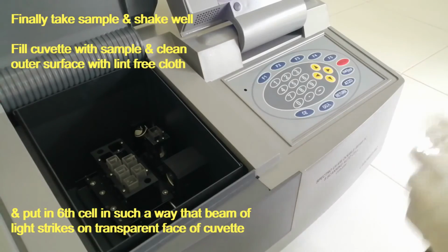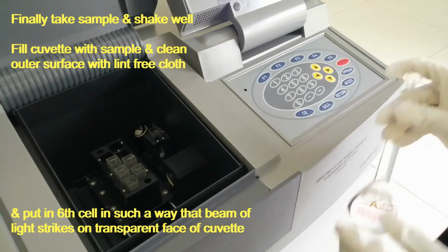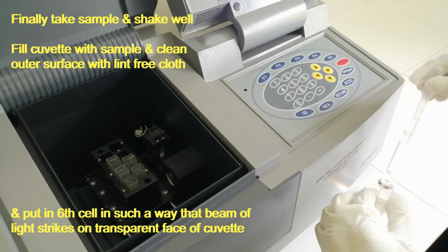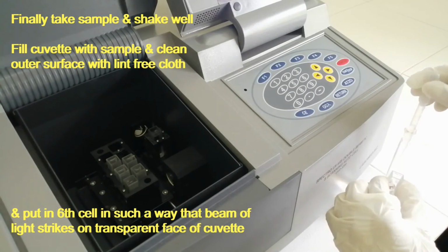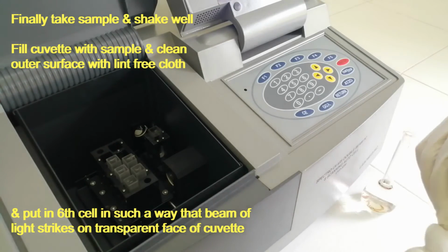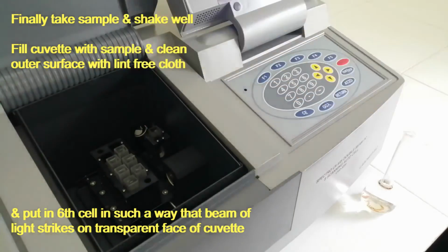Finally, take sample and shake well. Fill cuvette with sample and clean the outer surface with lint-free cloth. And put in sixth cell in such a way that the beam of light strikes on the transparent face of the cuvette.